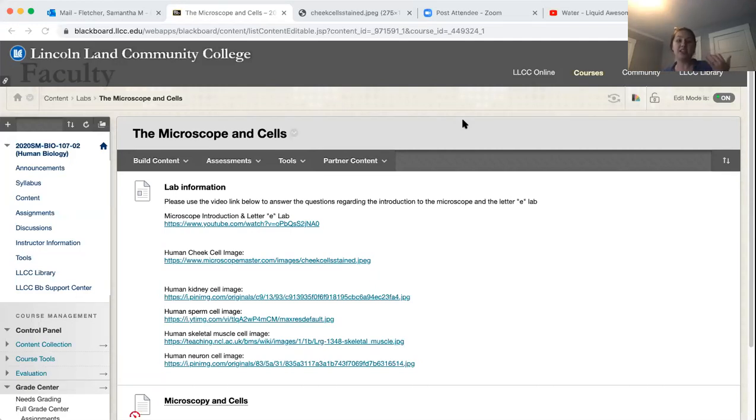You're going to see that tonight. When you look at the human cheek cell, the human kidney cell, all of those, you're going to be able to see individual organelles underneath the light microscope, which is awesome. It's so cool that we can actually see those structures. And I'm very disappointed that we're not getting the chance to do this in person, because one of my favorite parts of this lab is where you take a scraping from your own cheek, and you can look at your own human cheek cells underneath the microscope, and you're going to see the nucleus. You're going to be able to see all of the different organelles that are found in the human cell. So yes, organelles, for sure we can see that.